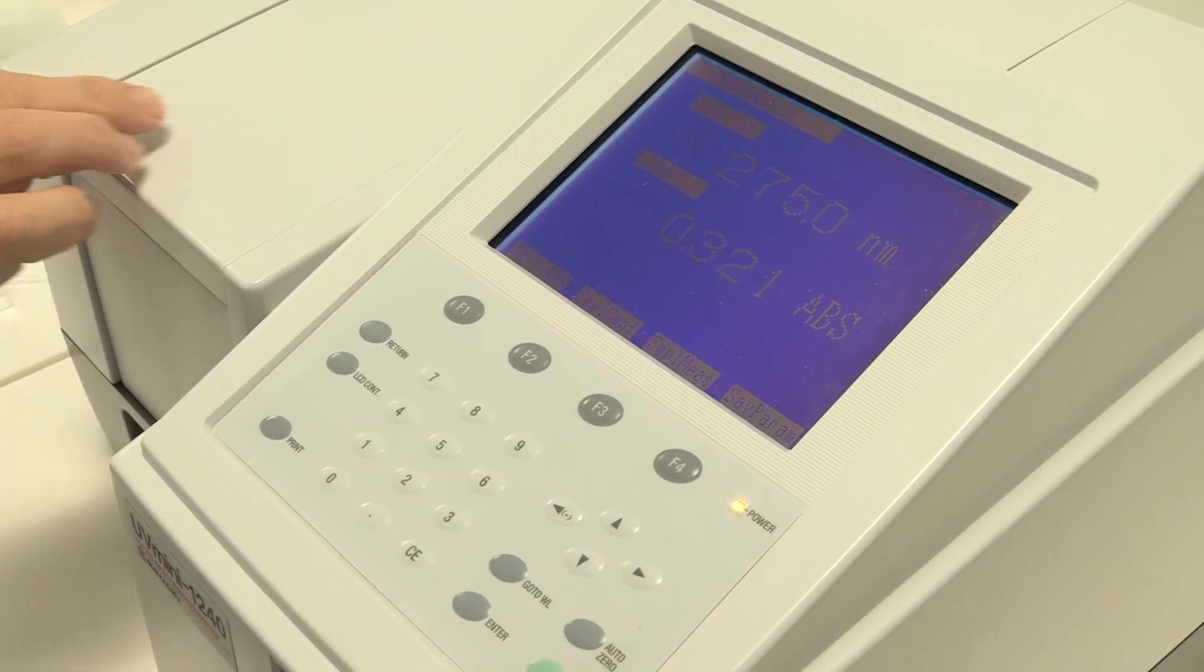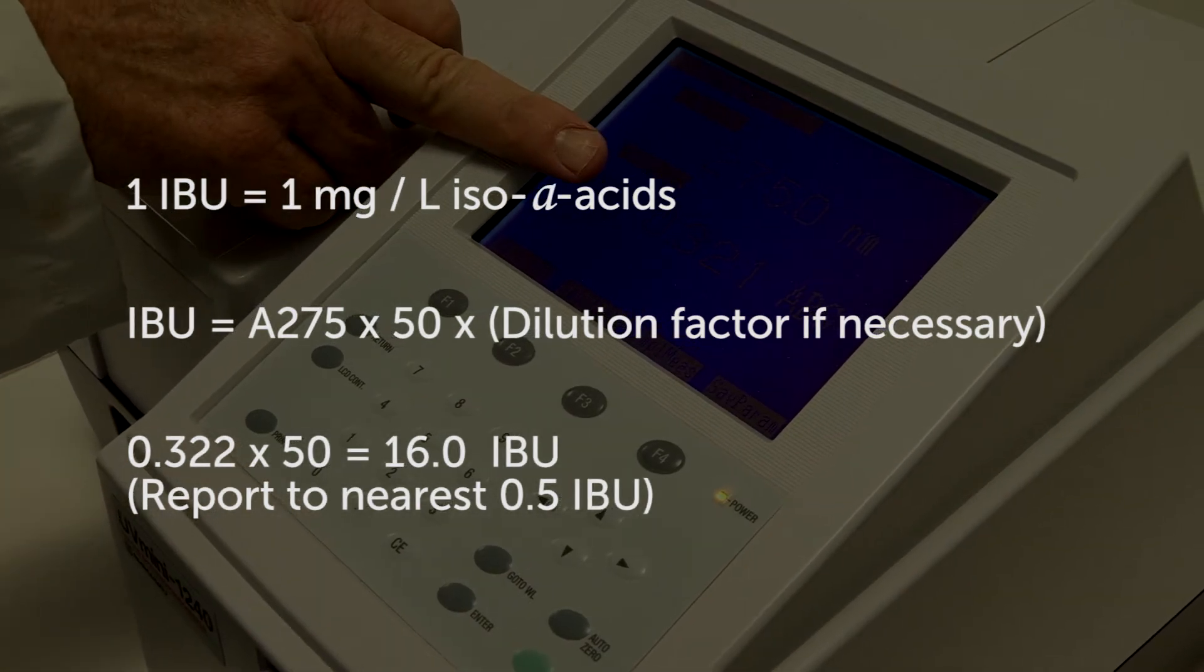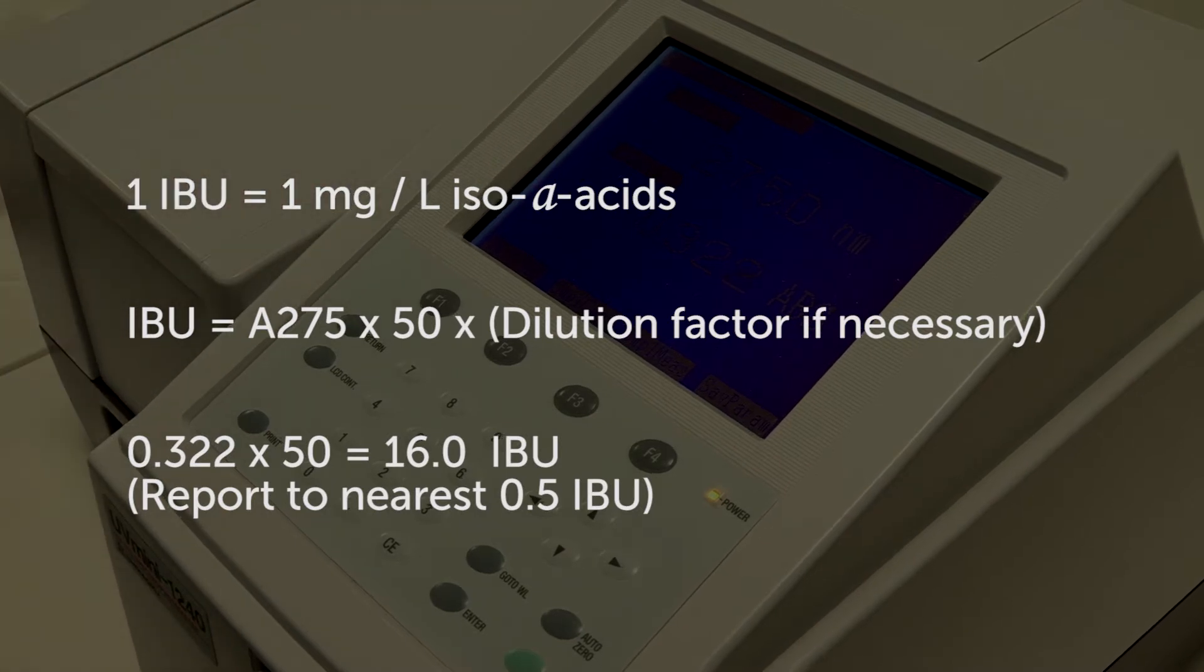The reading from the spectrophotometer is multiplied by 50 for iso-alpha acids derived from kettle boiling. Tetrahop and other hop extracts may have different conversion factors. Some preservatives such as benzoates and potentially dry hopping can also interfere, so under these circumstances HPLC is advised.